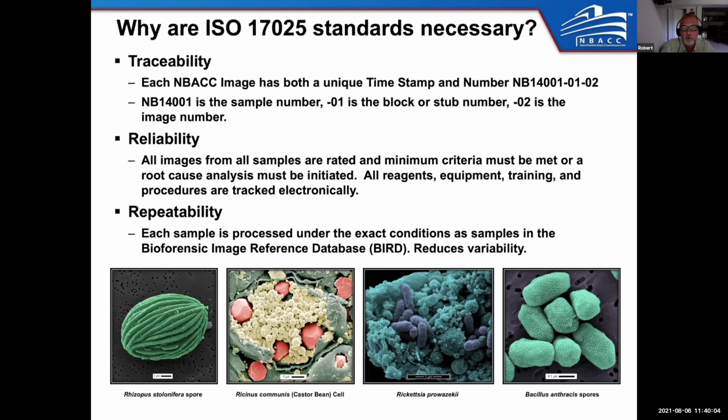A lot of you have heard of the word ricin because people try to make and purify this stuff. I can simply look at a sample of ricin, and if I can see that the lipids and all the stuff is still there, then these people have not really begun going down that rabbit hole of a nefarious act; they simply took a castor bean and crushed it. So the third thing is rickettsia, a tick-borne disease, and the fourth is more pictures of anthrax.